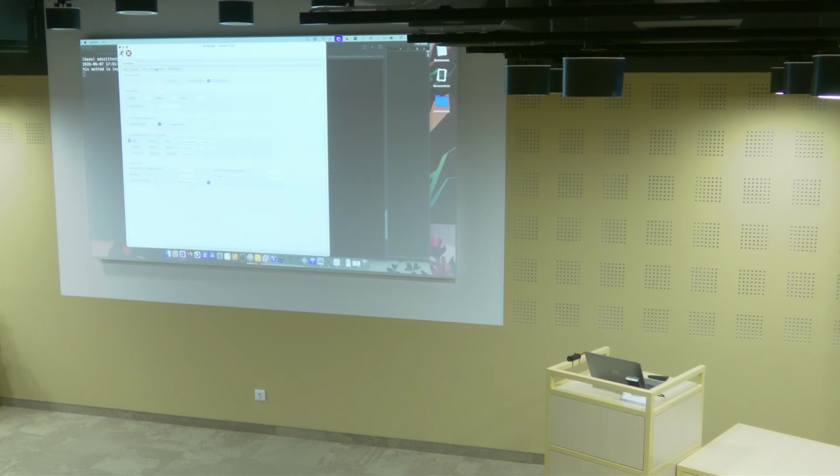So the next tab contains FOFO extrapolation, where you can find the different parameters for your Fourier difference map and your extrapolated structure factor amplitudes. By default, it will run in the calm and curious mode, but as I said, you have to be calm but curious, and you need to have some time. So we definitely don't have time, so we're not going to do that.